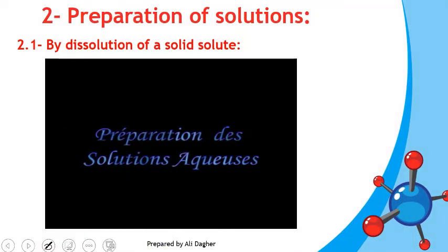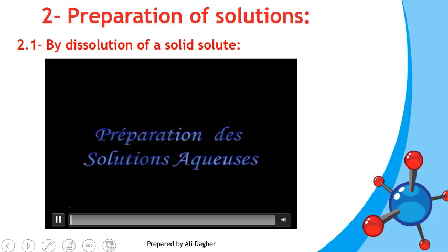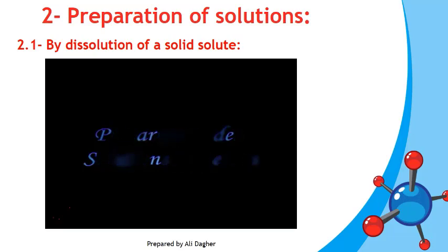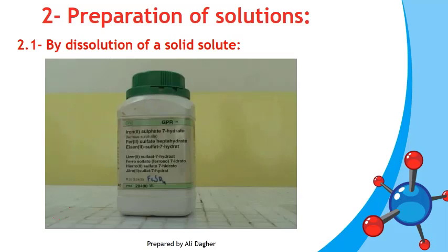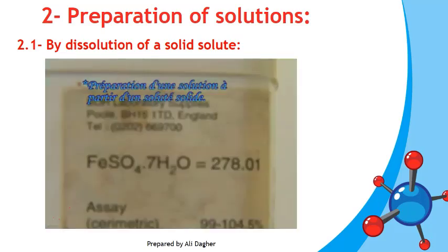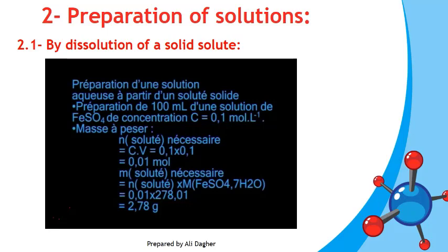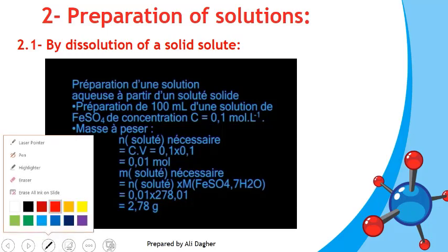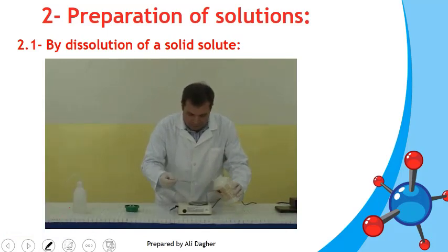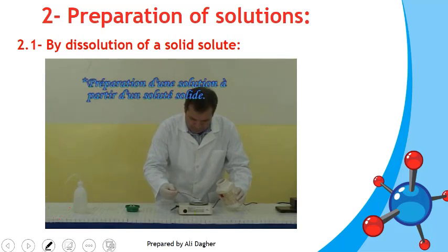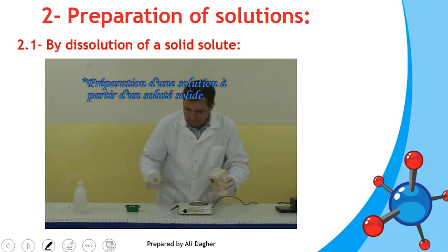This video will show us the preparation of a solution from a solid solute. The solid solute is iron(II) sulfate. First, we calculate the mass needed. We need to prepare 100 mL of a solution of concentration 0.1 mol per liter. We then weigh the calculated mass using a precision balance, watch glass, and spatula.